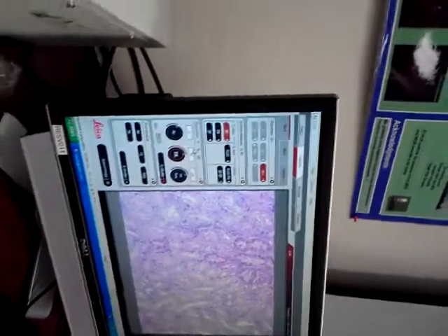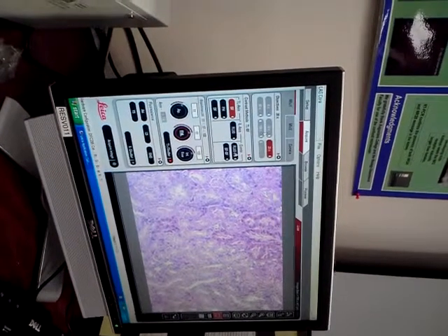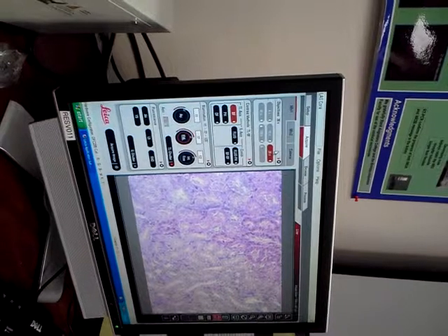It's basically the same thing that your scope does with the buttons and intensities and whatnot. So probably just... yeah, I wouldn't really. You can use it if you want, but it's easier just to use it on the scope.